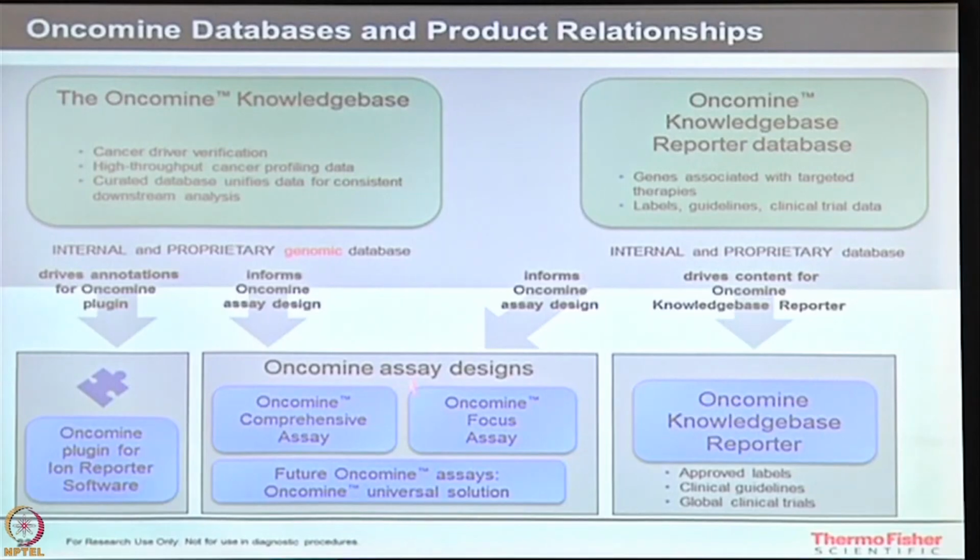Okay, and the same thing is available as My Design assays. So what I was talking about earlier in AmpliSeq, that I would like to design my gene assays or gene regions of interest and then sequence them to know which are the diagnostic variants that you are getting. The same thing is coming over here.